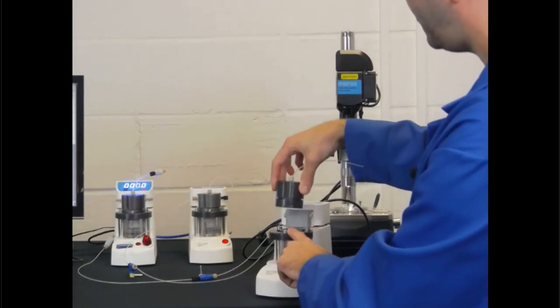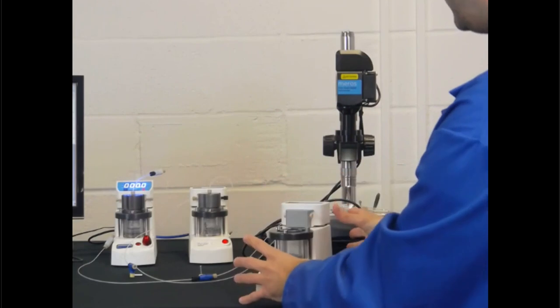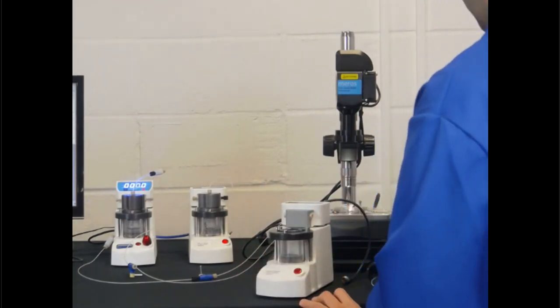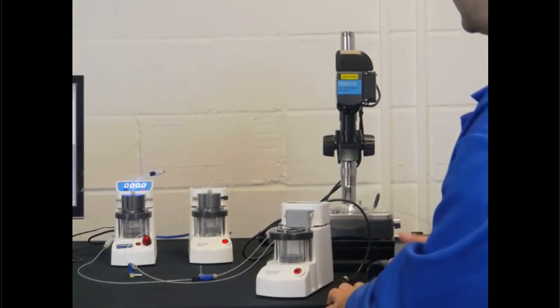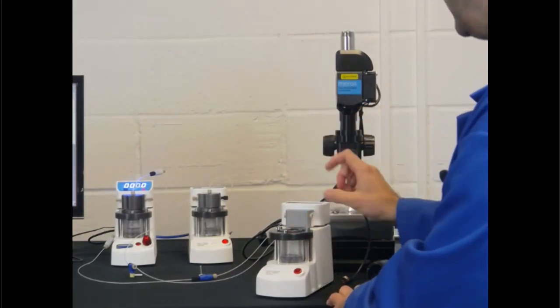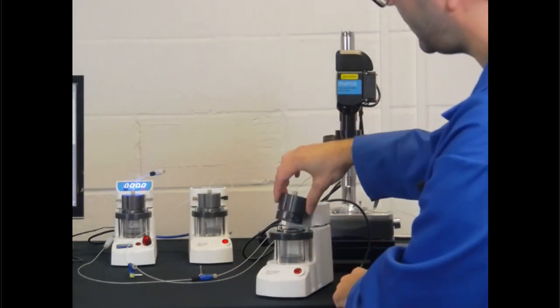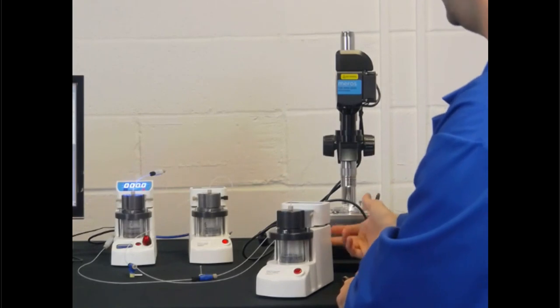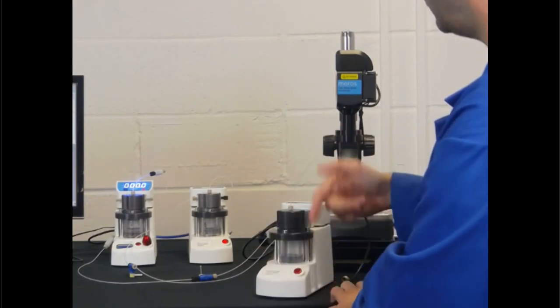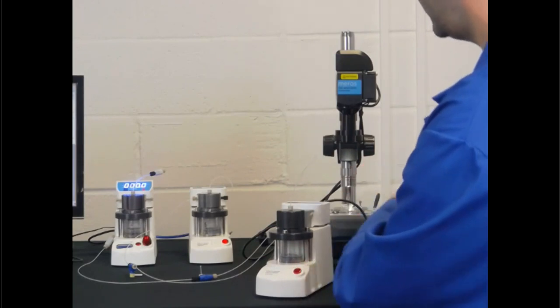This is the pump which has the reservoir embedded in the hardware. So if you want to store your solution inside, you just need to put your solution here in a vial, and then this is the tubing which goes inside the vial. The pump is connected to the gas compressor, and the pressure is adjusted in a way that the fluid goes from the reservoir through the tubing to the chip.